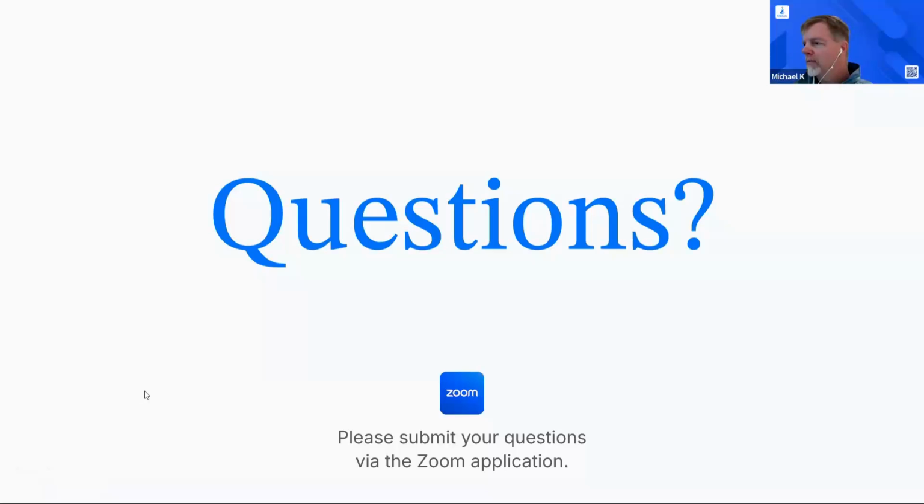Thank you for that. Maybe this one for Olga. RCM was mentioned briefly. RCM integration with this platform, kind of an overview of how that works. I think you mentioned one source of truth, which I think will catch a lot of people's attention. Just like a high-level understanding of what that means from this platform's point of view.